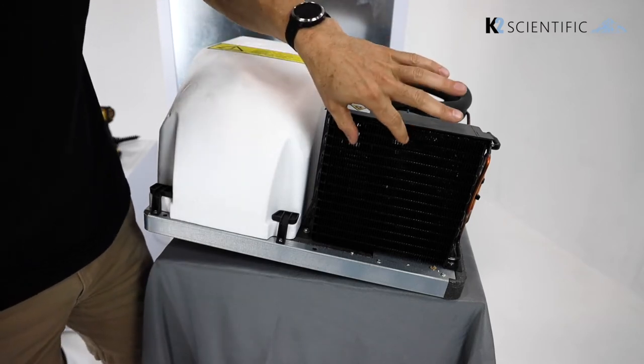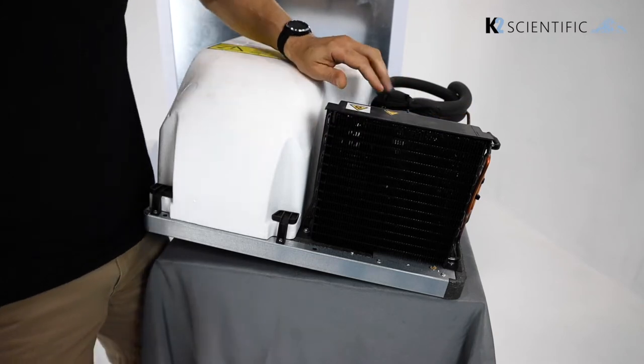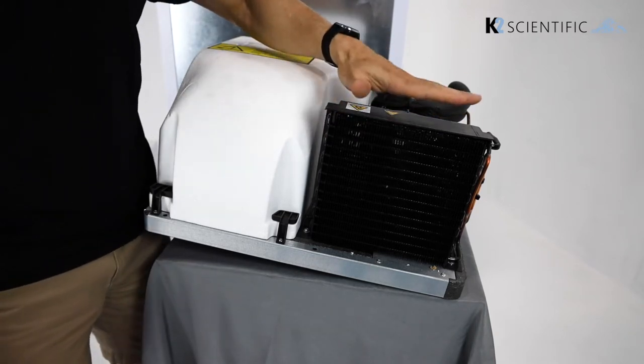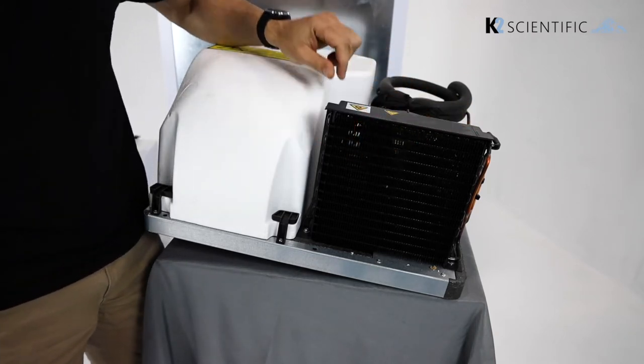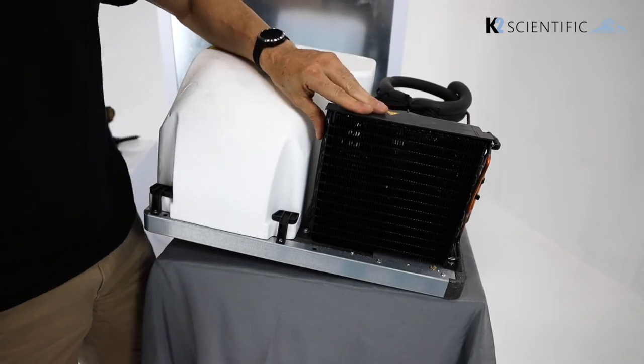From time to time these fins can get clogged with dust and debris. That's where problems can arise, because if the unit can't cool down the refrigerant as it goes through the system, it can break down and ruin the entire refrigeration system.